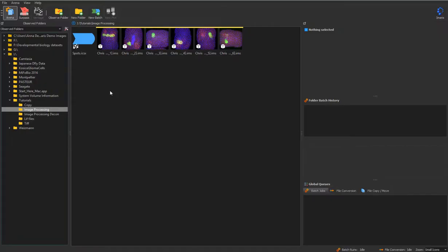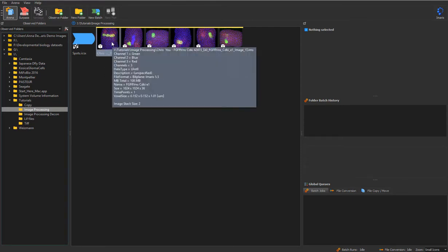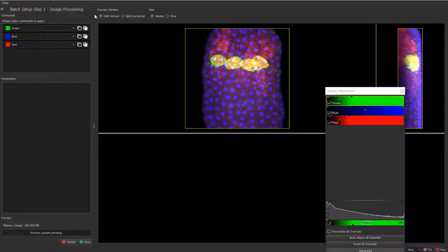In this tutorial, you will learn how to set up a batch protocol, including both image processing and object detection steps. To start setting up a new batch pipeline, simply select New Batch icon.